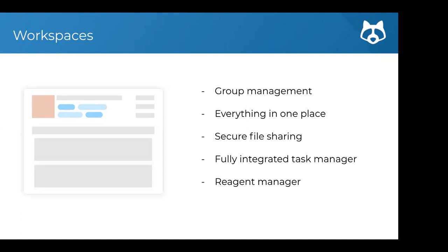Workspaces allow for secure file sharing and come with many other functionalities. One thing I want to highlight is our fully integrated task manager. If you're planning out experiments — especially after COVID — you can structure tasks with a calendar for the entire team to show exactly when somebody's in the lab and doing what. There's also a reagent manager to track all reagents available in the lab, which is also useful when building protocols.